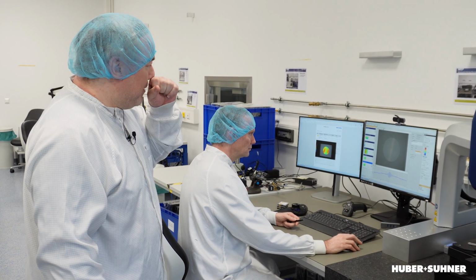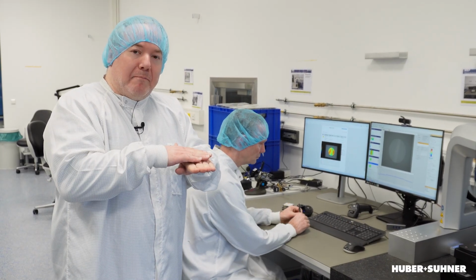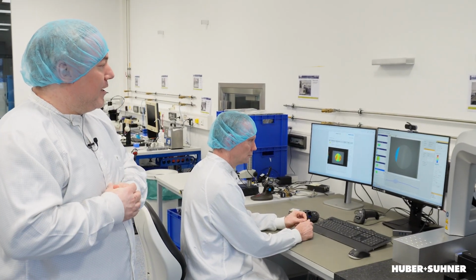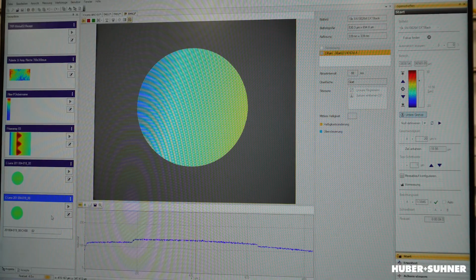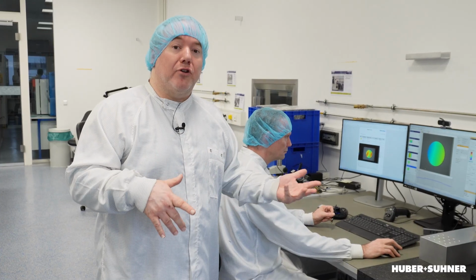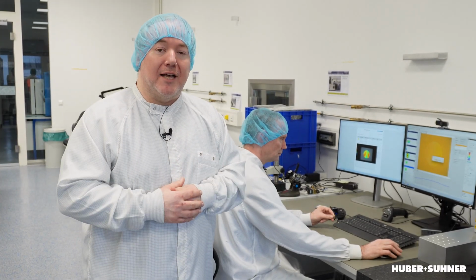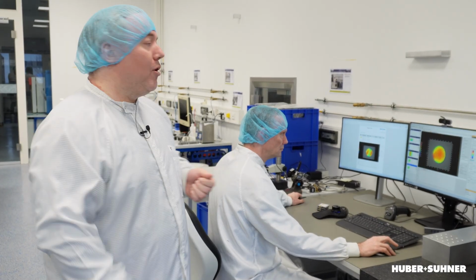If we now look here, you can see the camera picture and you see the interference pattern. And if we start the measurement, the head is now taking pictures at every height. So we are slicing the height, and like that, it is possible to calculate the height profile or the profile of the surface, but because it's not a flat mirror surface as we discussed before, this is a real live surface with scratches and all that stuff.